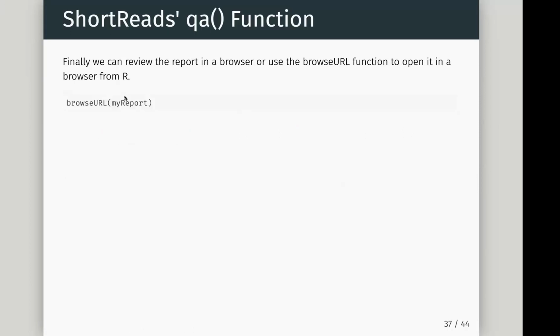I'm not going to show you this. I'm going to show you our quality tool at the end very briefly. I think it's a lot faster than this ShortRead one, although the ShortRead one's perfectly acceptable.